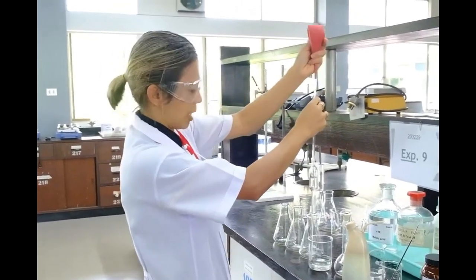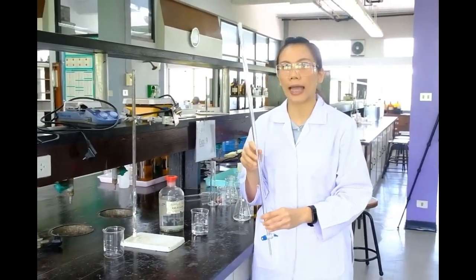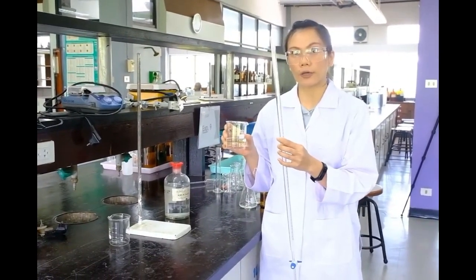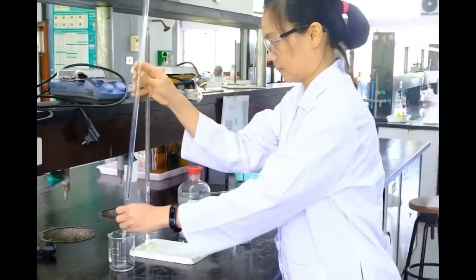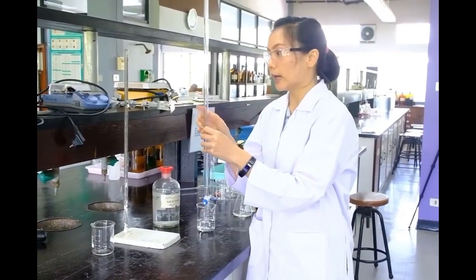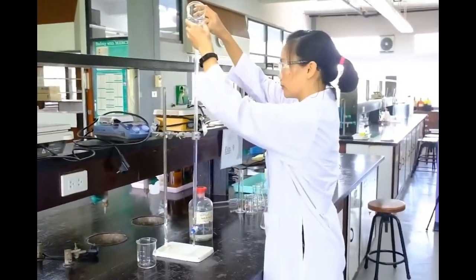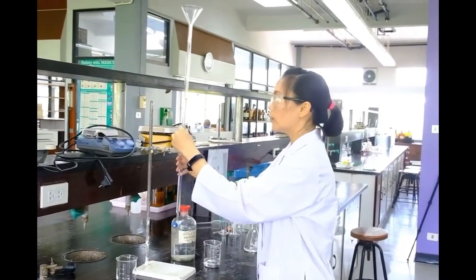For titrating the KHP solution with sodium hydroxide, first prepare the sodium hydroxide solution. Pour it into a 50 milliliter burette, rinsing the burette beforehand with a small amount of the sodium hydroxide solution. Then clamp the burette while adding the sodium hydroxide solution.